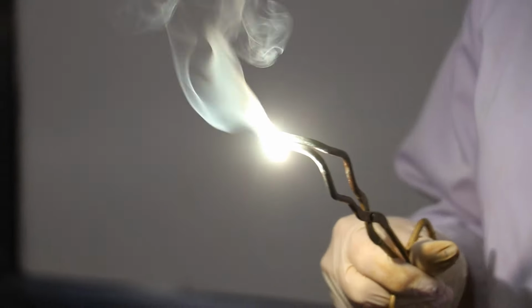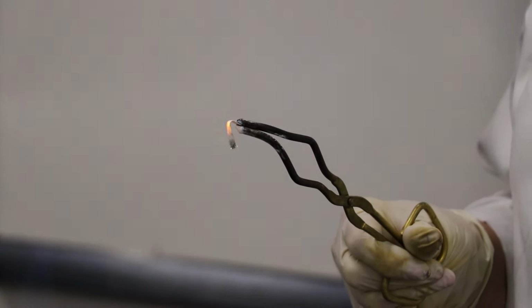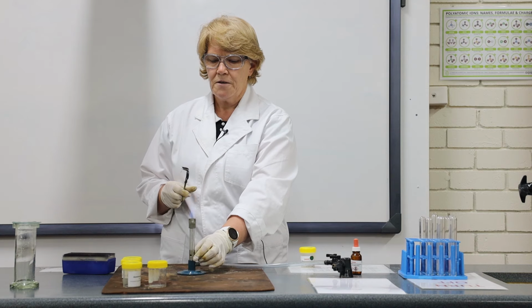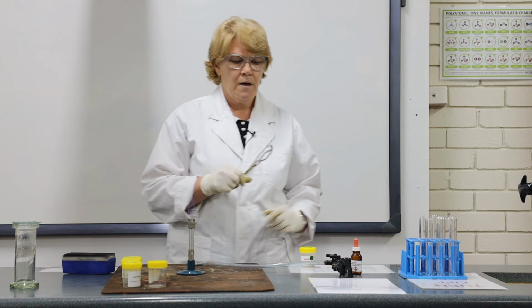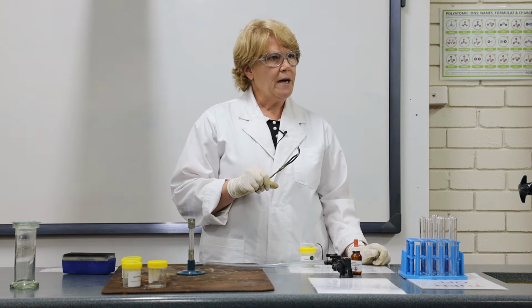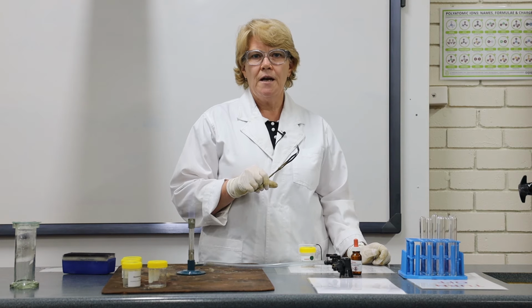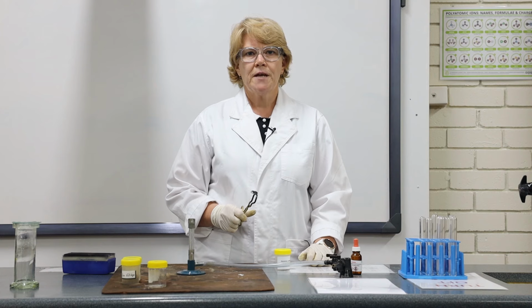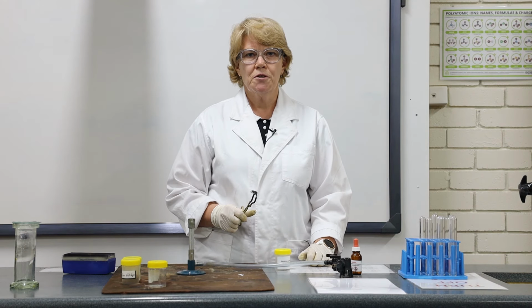It's a very, very bright light. You don't want to stare at this light for too long. It can really damage your eyes. Let's have a look at the product of this reaction. We started out with shiny grey magnesium, and now we have a white powdery substance. This is magnesium oxide.